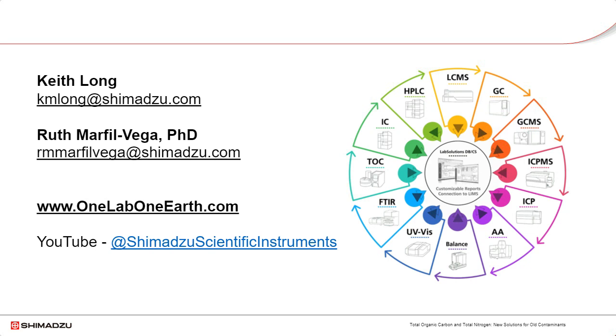And the scrubbers inside the instrument, specifically the halogen scrubber, do have indicators when they become consumed. So one of the scrubbers in there will change colors when it becomes consumed. And the B-type halogen scrubber, there is some stainless steel mesh in there and an acid solution. So the acid solution will also begin to change colors as it absorbs halogen. So it's very easy to tell when it's time to replace these scrubbers.